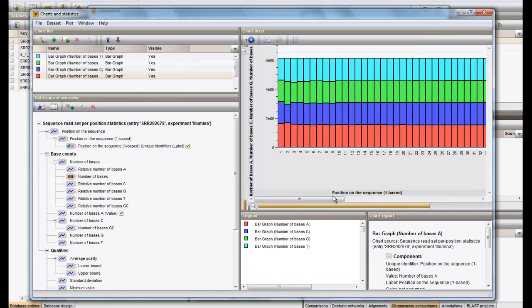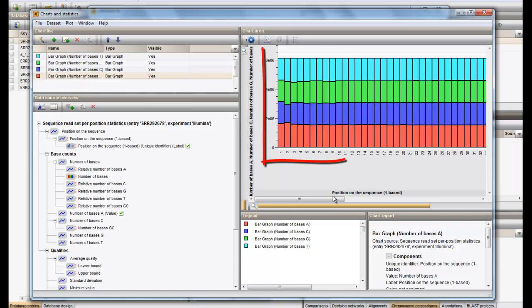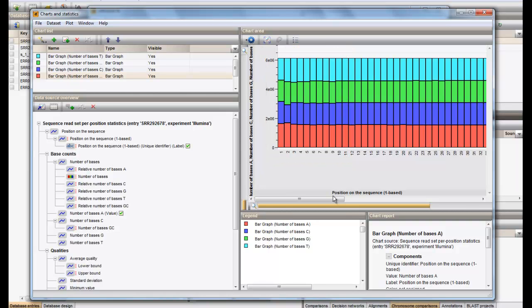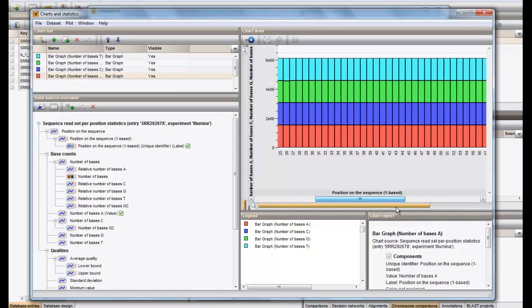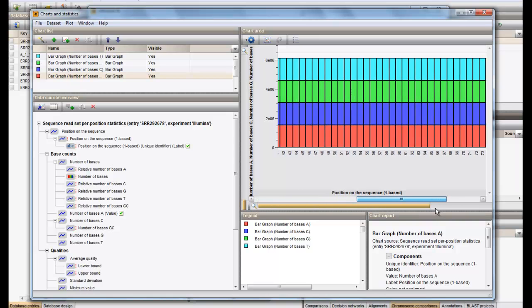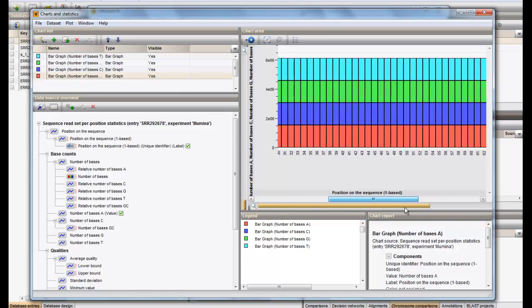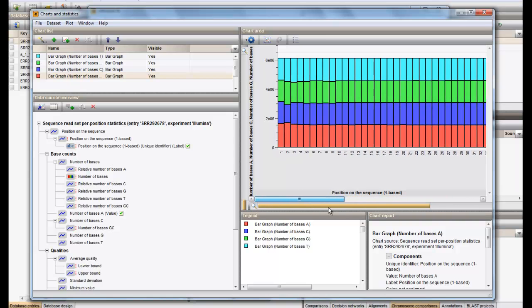Except from some distortions in the first 10 base pairs of the reads, we can observe an even distribution over the bases A, C, T, and G. From this chart, it is very straightforward to detect whether or not the primer sequences were cut during import.